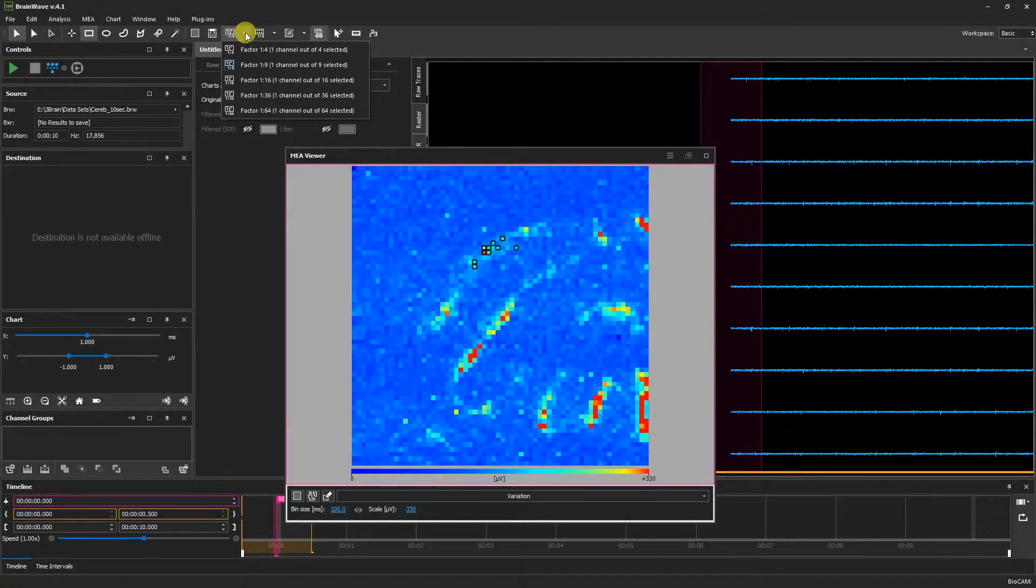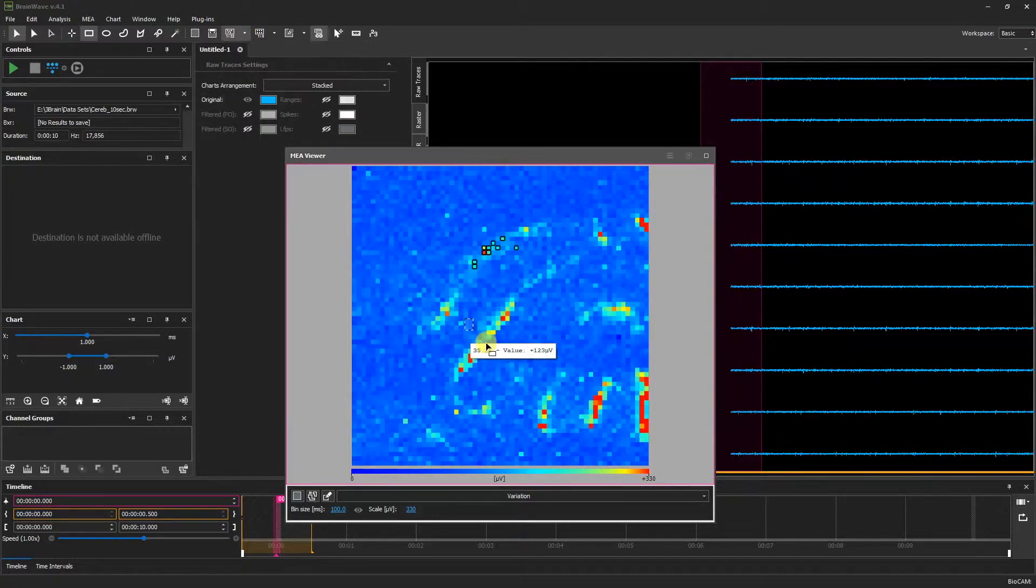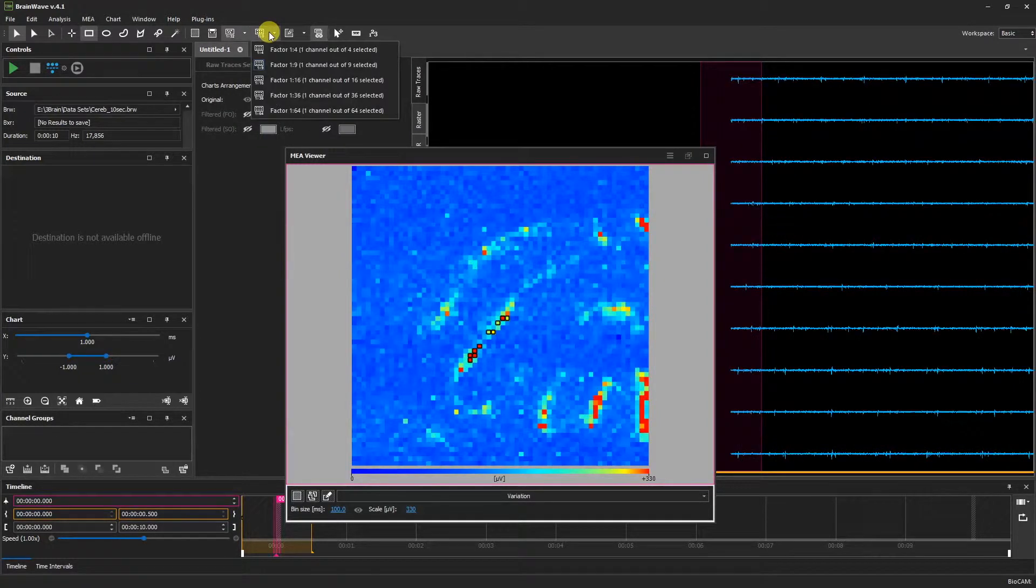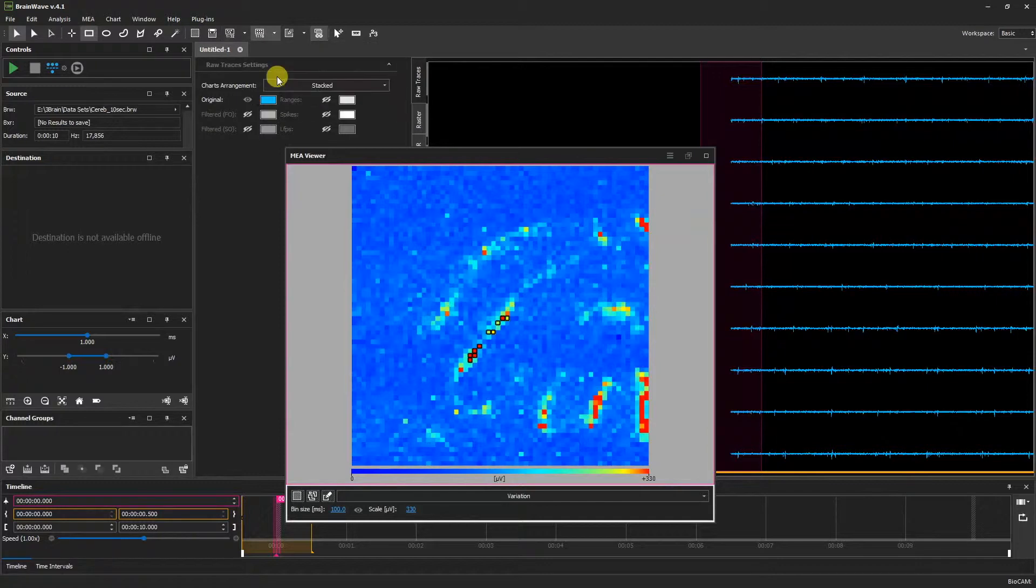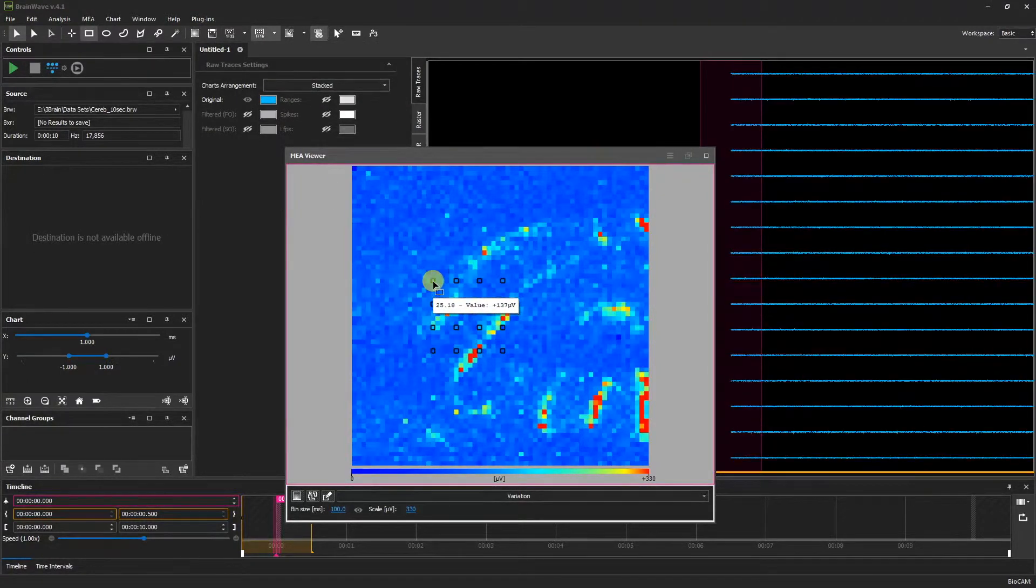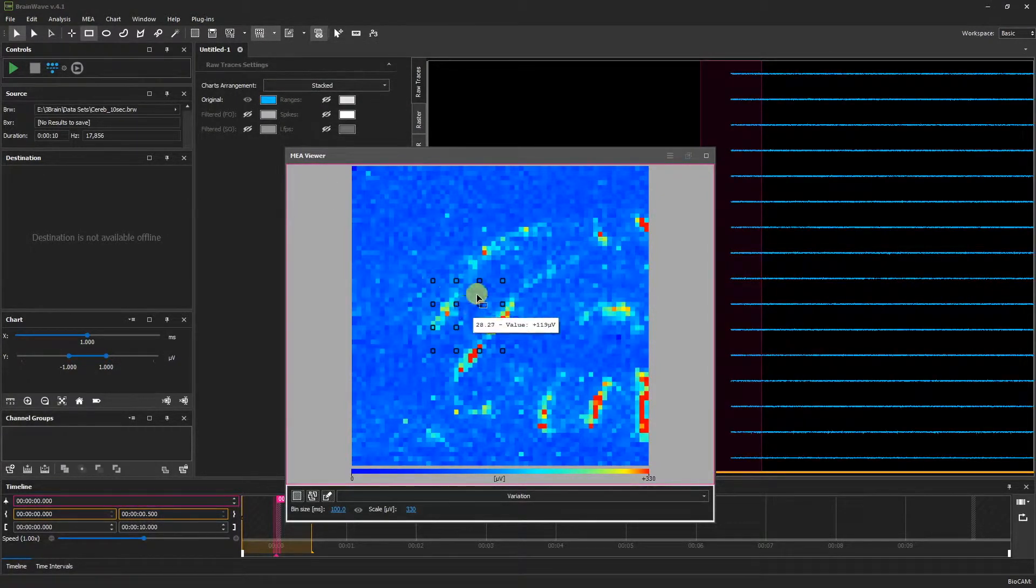We can further adjust this setting by choosing the selection factor. We can also select by grid. When we click and drag, we see that only a ratio of channels have been selected.